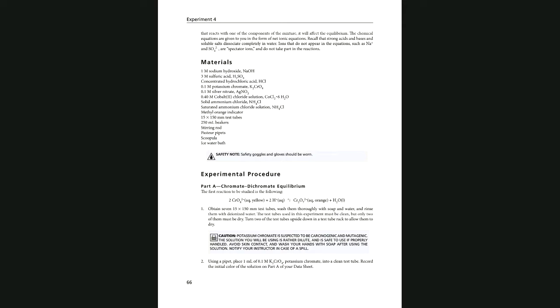But in 1046 class lab, you should say the addition of the sulfuric acid, or H+, disturbed the equilibrium, and the reaction shifted to form more product to cancel or neutralize the pressure of addition of concentration of H+. So be careful when you are recording your observation, and record it more scientifically. It's going to help you to fill out your data sheet easier and better.